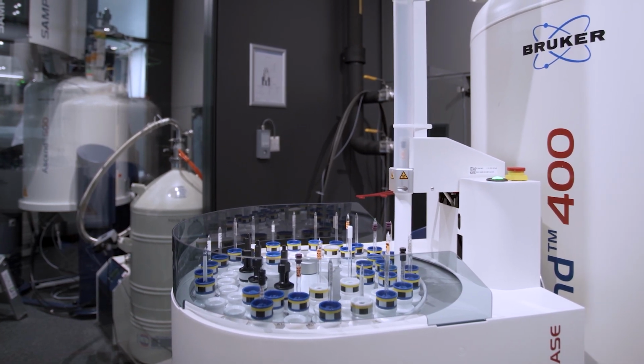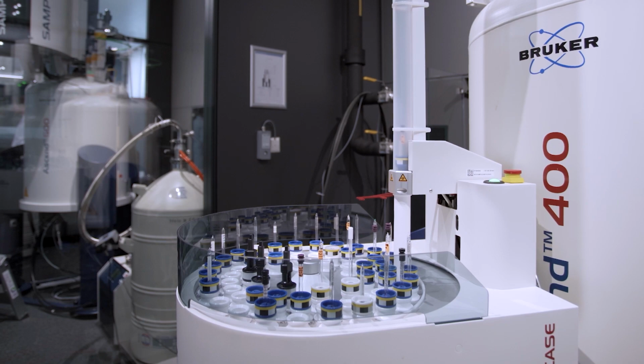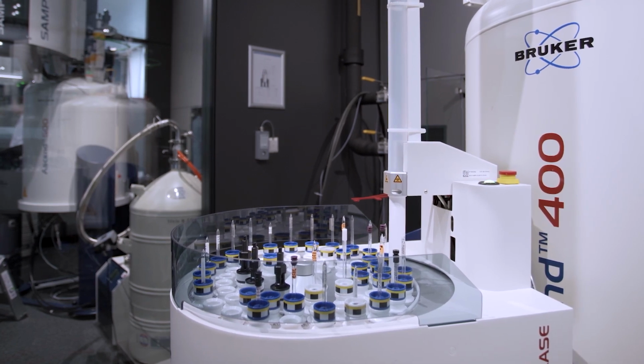And by chemical species, I mean short-living phases, I mean metastable phases even. And this is, of course, a very powerful technique to learn something about the chemical processes that are happening while you charge or discharge, for example, your battery material.